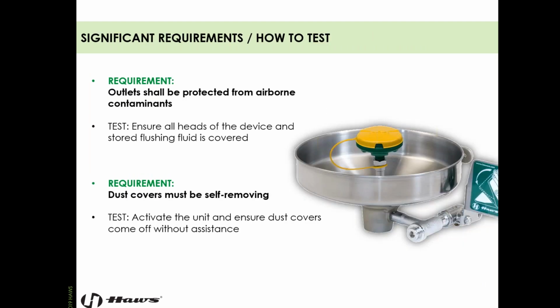The outlets need to be protected from airborne contaminants. You just have to have your dust covers in place. Unfortunately, employees frequently leave these out of place. They forget to replace them after testing, or heck, I won't tell you where, but I caught an employee at a site using one as a drinking fountain. And I was like, number one, ew. And number two, we didn't have dust covers on anywhere in this facility.